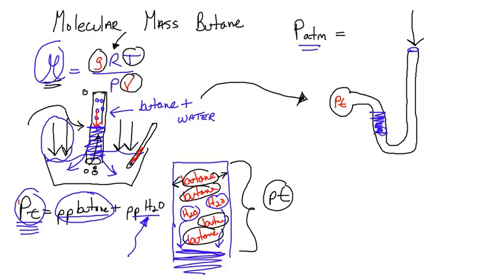And what I just did is I've taken this suspended water by the atmospheric pressure, and I'm now just kind of relating it to a very simple manometer drawing. If you look here, we have the gas molecules of the butane and water trapped in this little area. Same thing here, I'll put the water here as well. And then we have the gases in the air, the nitrogen, the oxygen, and trace amounts of other gases pushing down here. Now we can see that the pressure ATM is winning. Winning by how much? It's winning by this height.